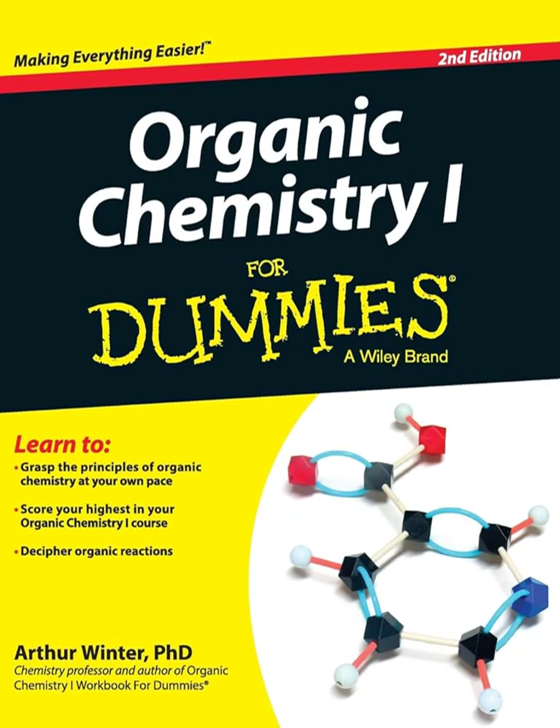Got it. You also mentioned some common patterns to look out for. Yes, these can save you a lot of time. Recognizing common groups by their combined integration and splitting patterns. Like the ethyl group. That's a classic one. A quartet peak integrating for 2H, coupled with a triplet peak integrating for 3H. That pattern almost always screams ethyl group, and that's just CH2CH3.